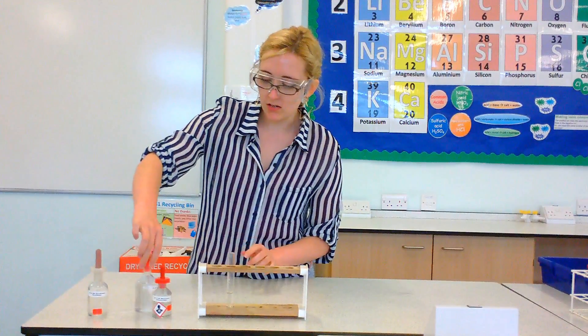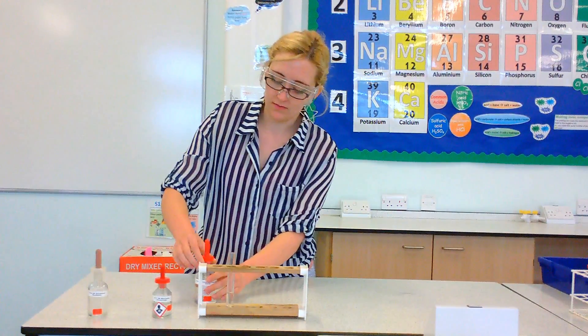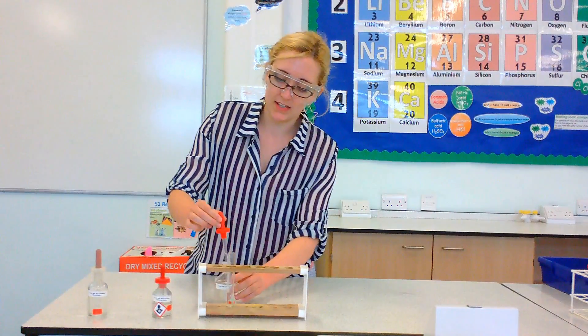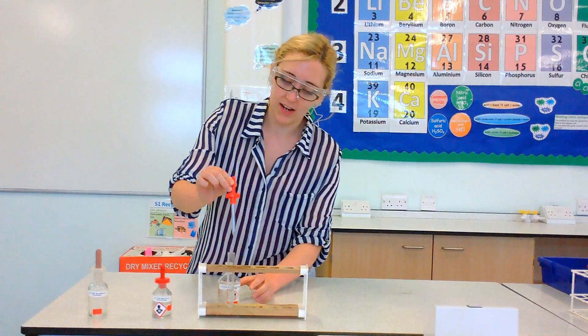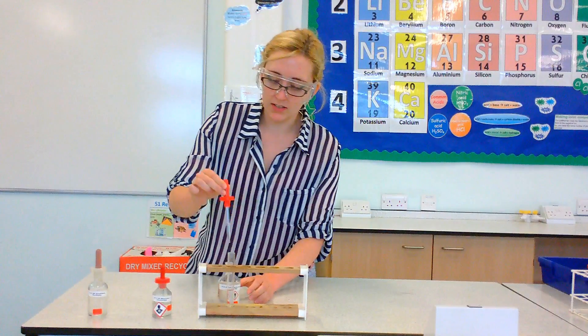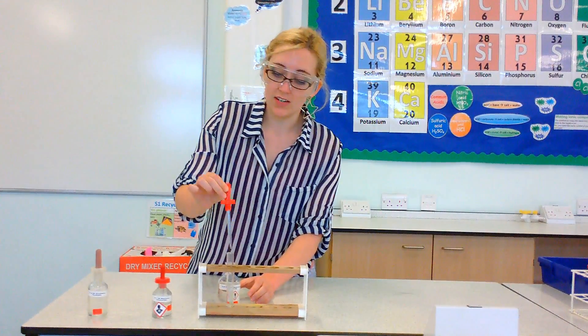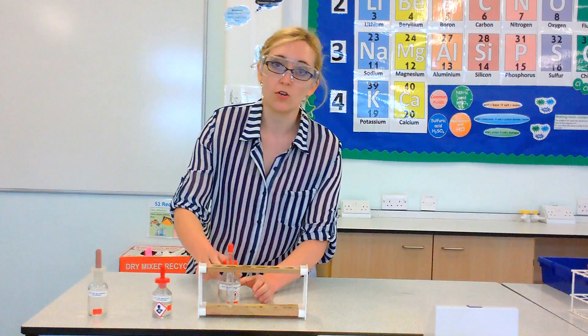First thing we add is some hydrochloric acid. This is because you need this to be acidic, so we need it to be a little bit acidic. So we're going to add about a centimetre. Technically I'm adding a bit more than that, but that's so that you can easily see on camera what I've got going on in here.